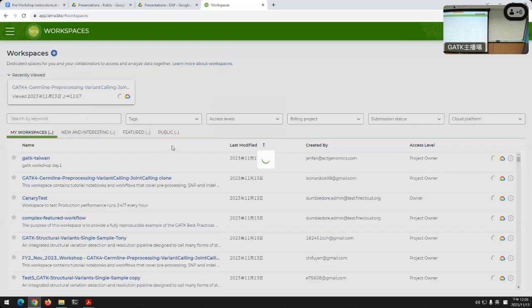A question? I'm the billing account on many workspaces, so that's what. Yes. You're using the wrong account. Same, it's the same for me. This page always takes a long time for me.